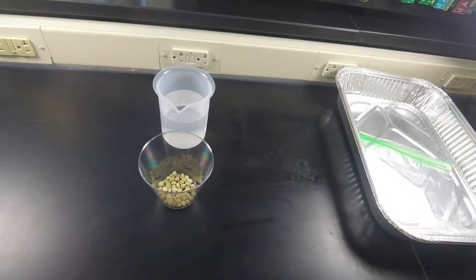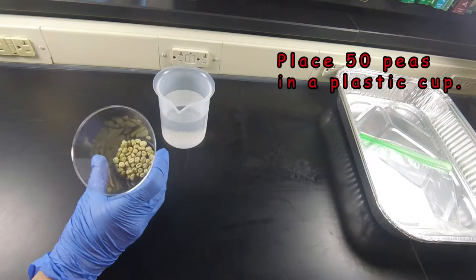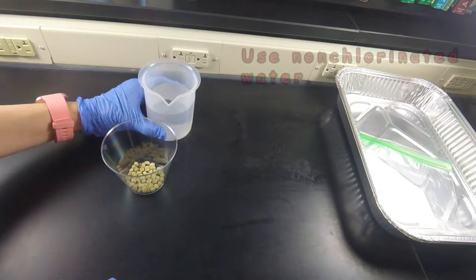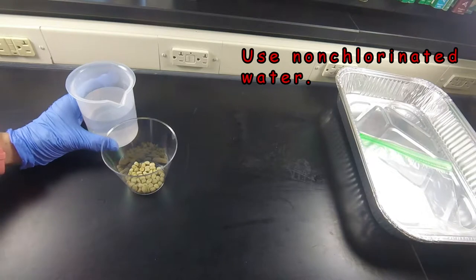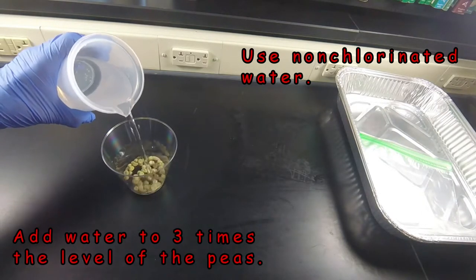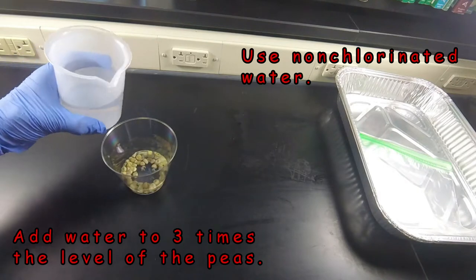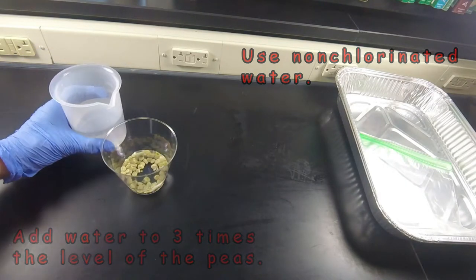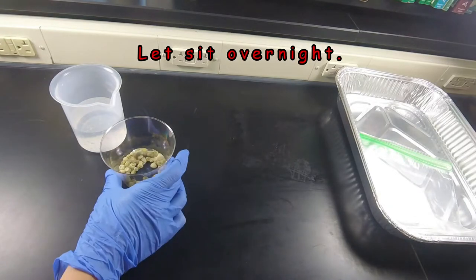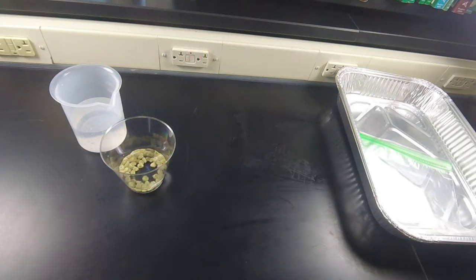The preparation for the respiration lab must be started 2 days before you plan on doing the lab. First, place 50 peas into a plastic cup, as I have shown here, and then using your non-chlorinated water, that means your bottled water, pour enough water into the cup so that the water is about 3 times the level of the peas. You want to make sure there's plenty of room for the peas to absorb the water. Allow this to sit overnight.